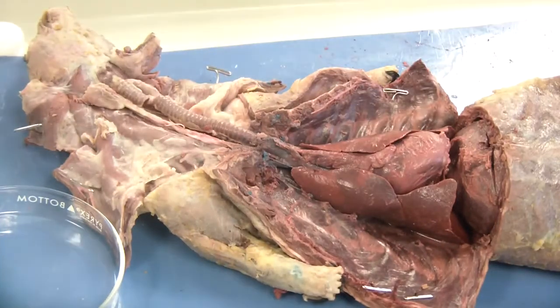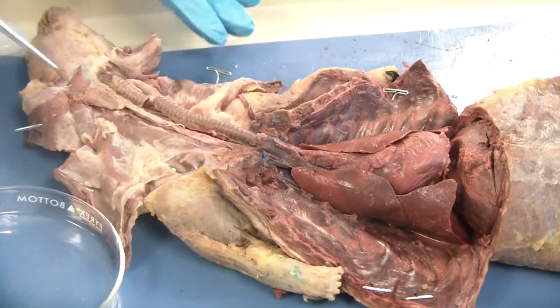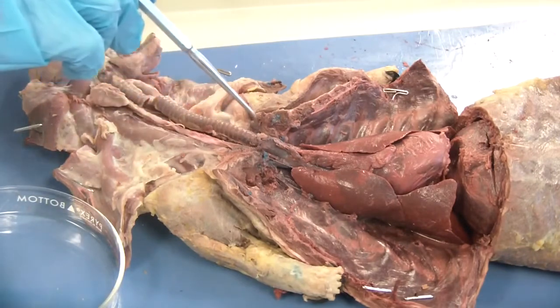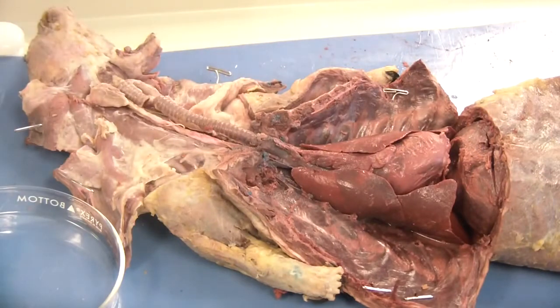Good morning anatomy students. Today is our demo for the respiratory system and endocrine system instructions. In front of me I have already reflected back the side muscles of the mink. There's a separate video to watch if you have questions about how to move those muscles back. Basically you're going to be taking a central cut down the middle and then creating flaps as you cut to the side.